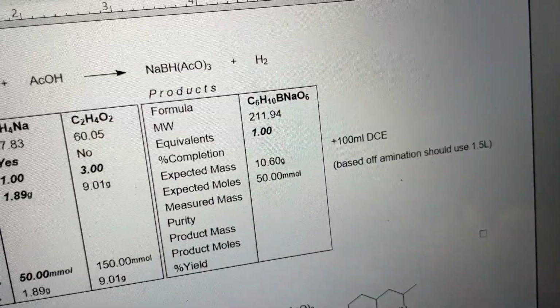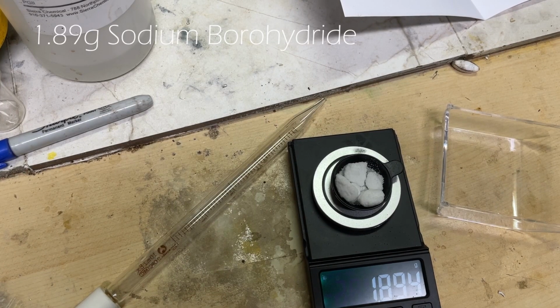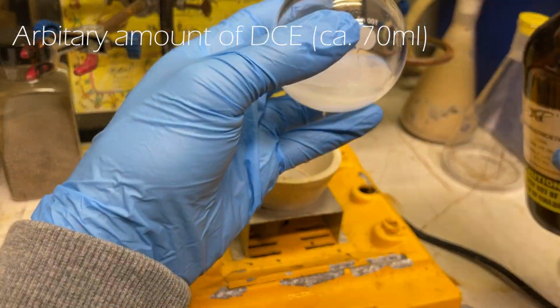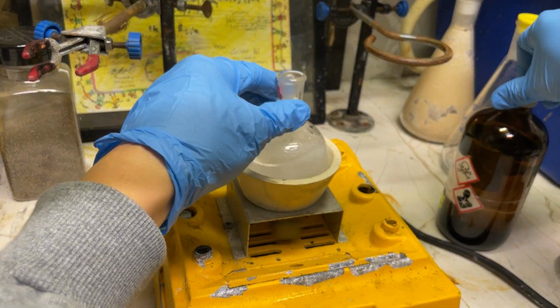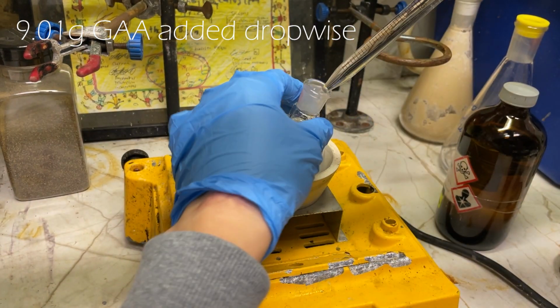And the solvent I chose is a random arbitrary volume because there's actually no info on the solubility. All it says is it's fairly soluble. So here you have 1.89 grams of sodium borohydride, which I'll crush up into a powder. An arbitrary amount of dichloroethane, like I said, because you can't find solubility data anywhere. I looked, there's no exact number, so let's just use a random amount that looks good, and we'll add 9.01 grams of glacial acetic acid drop-wise.